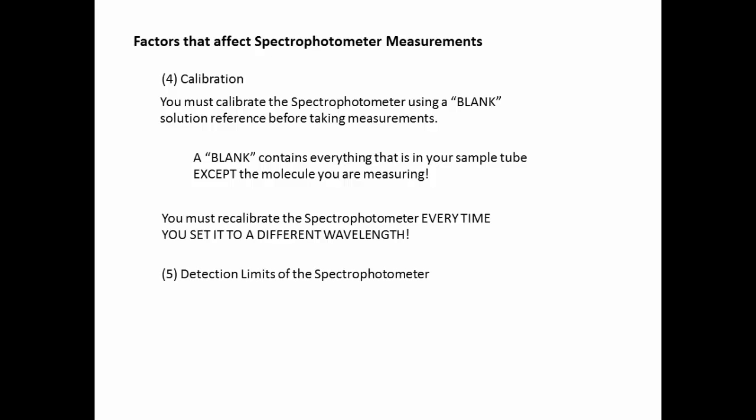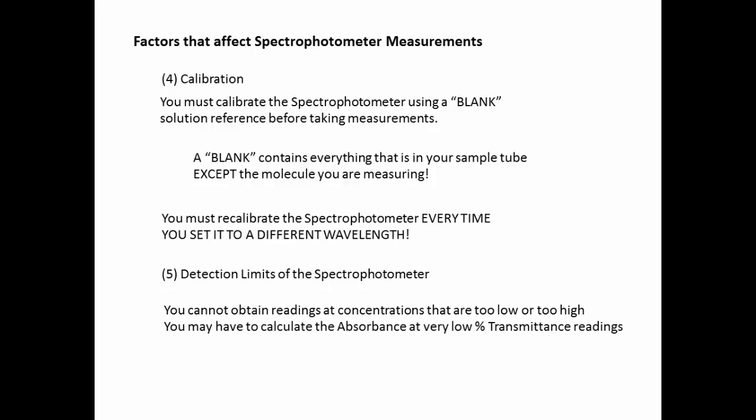Number five is that there are detection limits on the spectrophotometer. You cannot obtain readings at concentrations that are too low or too high. In some cases, the machine will still be able to read transmittance values, but when you ask it to report an absorbance, you'll just get a blinking number or an error or something that can't give you a reading or value. In those cases, you have to actually calculate the absorbance when the percent transmittance readings are very, very low. Refer to the handout to look at the formula for how to do this.